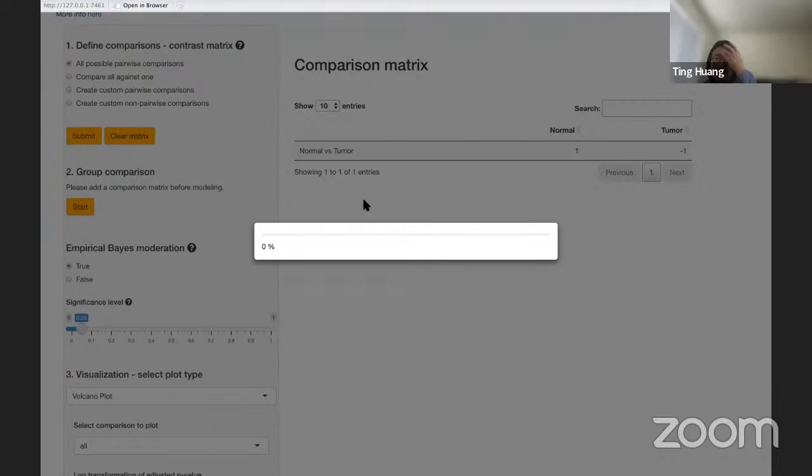I'm sorry, I can't remember the exact word, but from my understanding, they split the whole TMT mixture into different fractions, and ideally the different fractions will have completely different sets of peptides based on some criterion to separate the sample, and then each fraction is run through the mass spec.